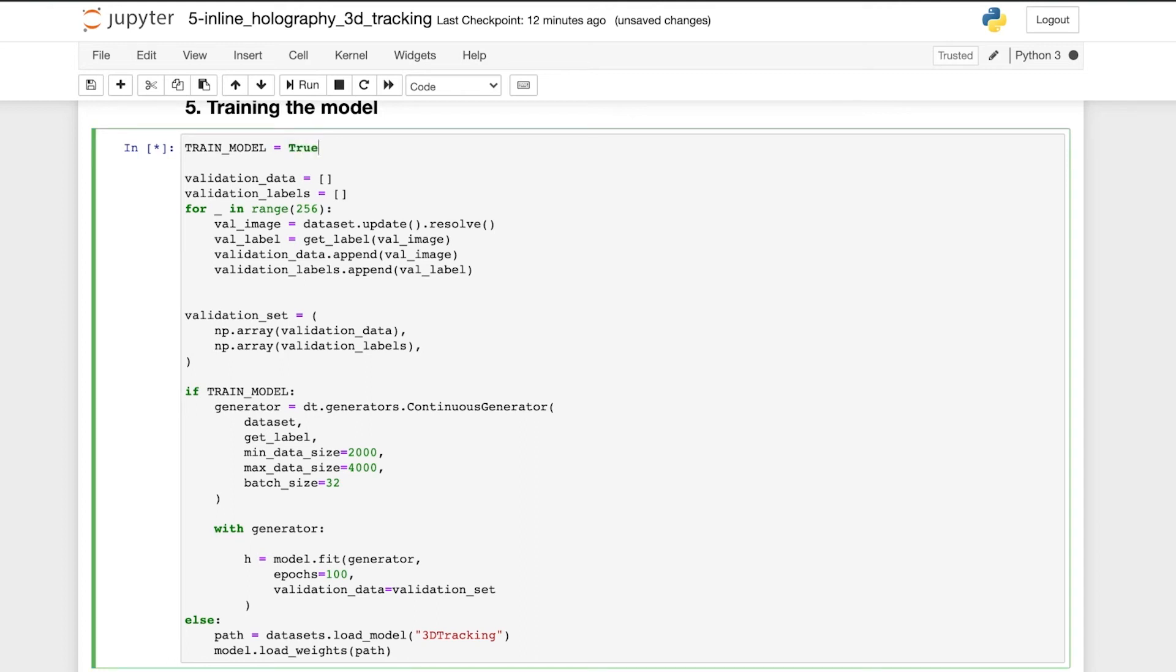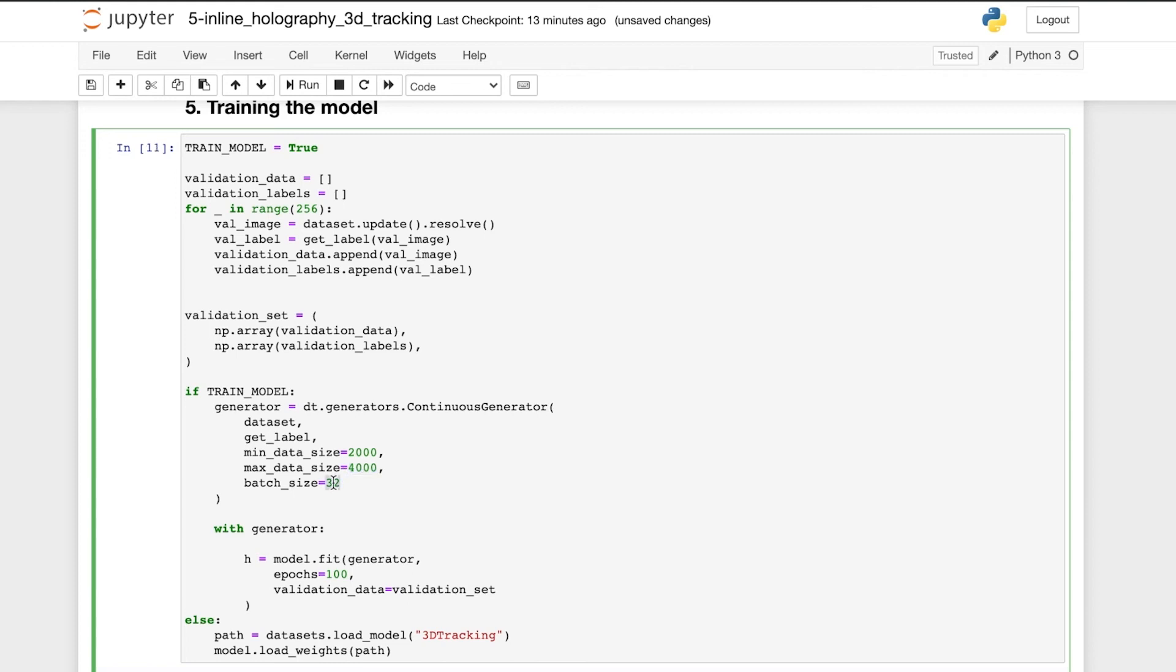Here we have a validation set of 256 images. And we use the continuous generator to continuously generate images during the training, with a minimum of 2000 training images and a maximum of 4000. And we use a batch size of 32 and train the network for 100 epochs. And now let's train the model.